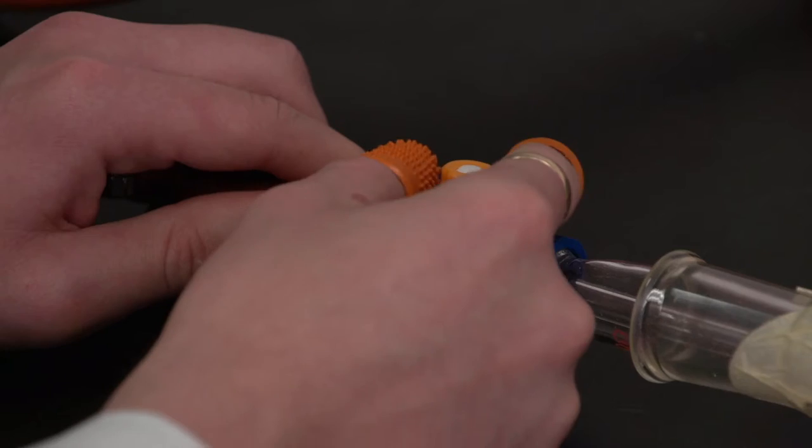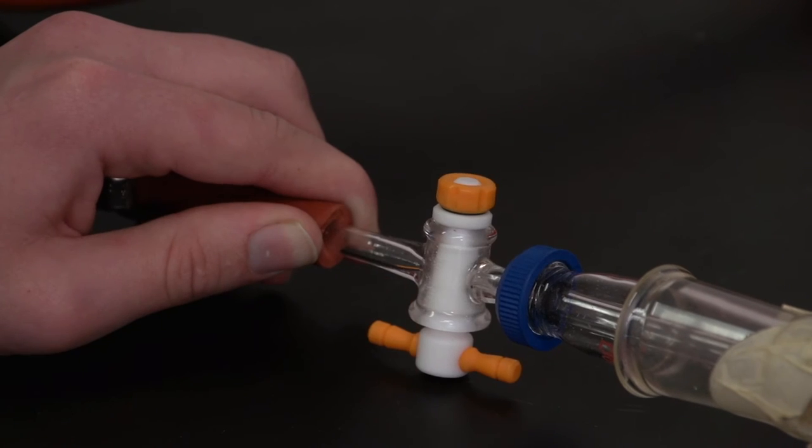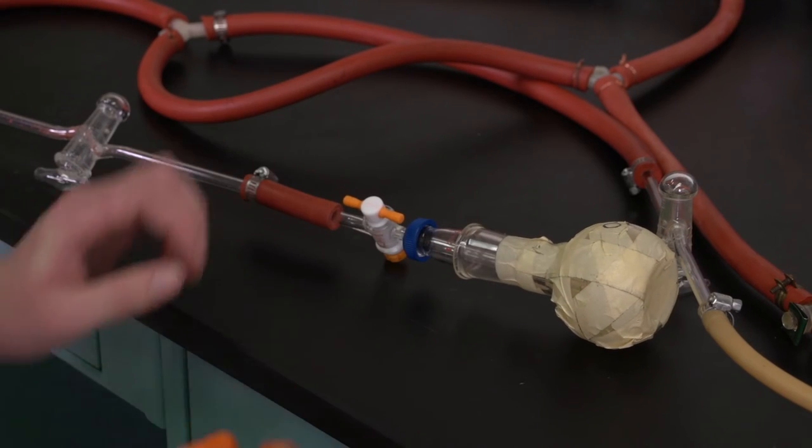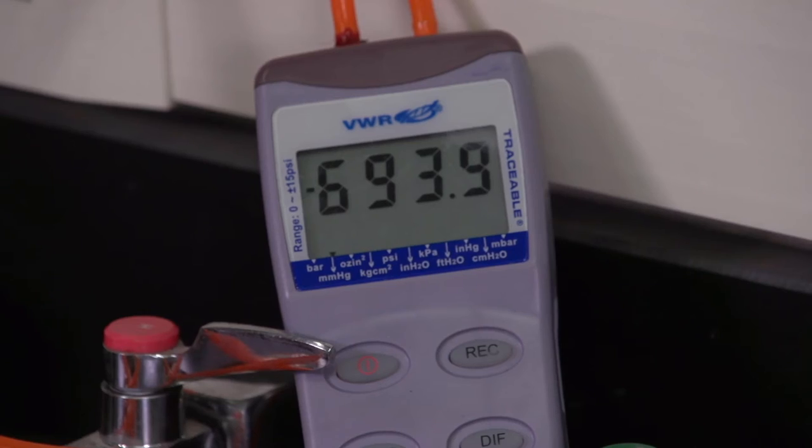To fix the leak, tighten all nuts on the stopcocks and make sure the bottle is firmly attached. Evacuate the system again.